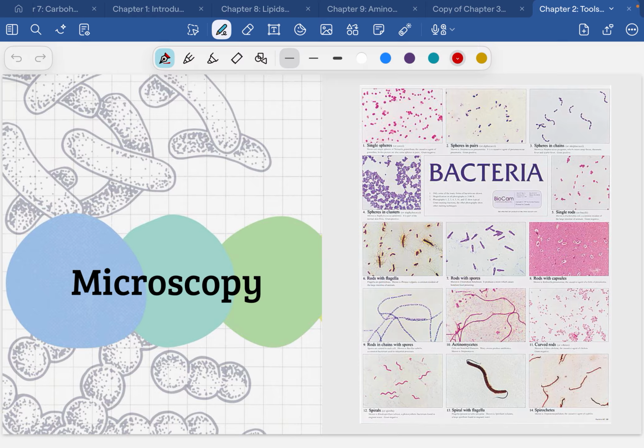inspection I, right? Half of that is looking at it with just our naked eyes, but another big part of that is looking at it under a microscope, right? These are microscopic organisms. We put a lot of effort and importance into seeing what organisms look like underneath a microscope. So we're briefly going to talk about microscopy and how you use a microscope, what a microscope does, and some advantages and disadvantages to certain types of microscopy.